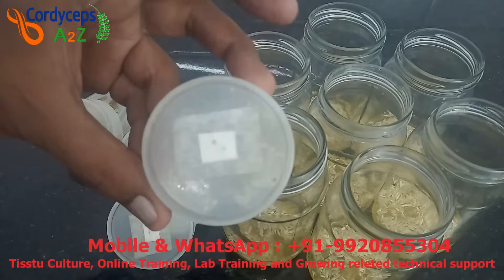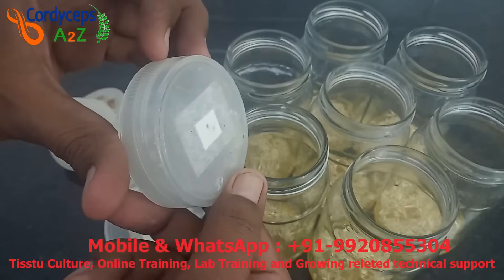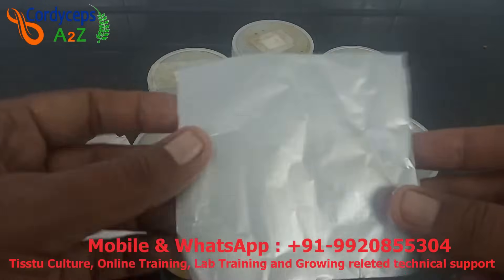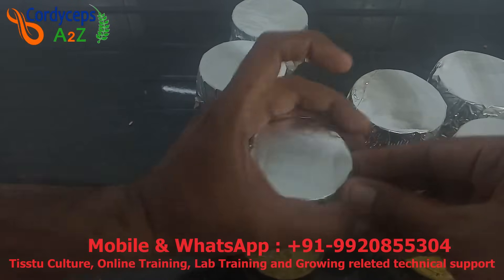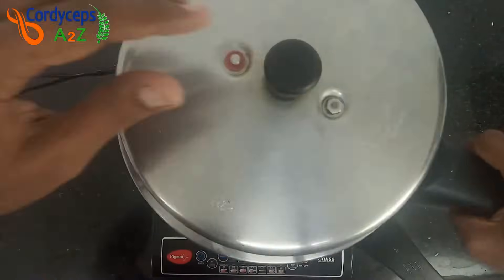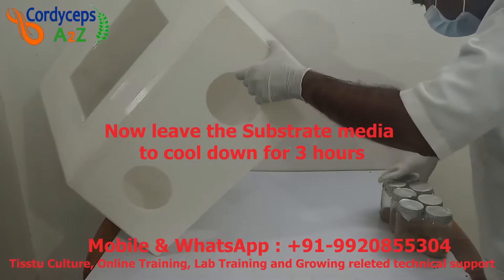Take a plastic cap with an approximately 5 mm hole and stick a piece of filter paper on it with tape. Fit this cap on all bottles and pack the cap with aluminum foil. Now sterilize these bottles using the same previous process. After 50 minutes of sterilization, keep them in the inoculation box to cool down for 3 hours.